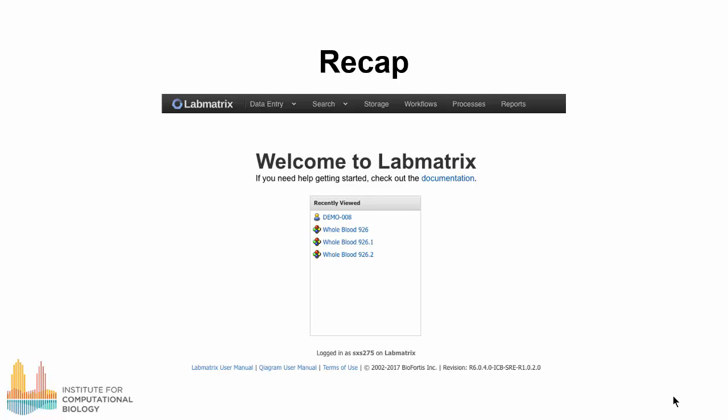In this video, we have seen the basics of Qiagram in LabMatrix, how to build a query, and how to work with reports. For more details, refer to the LabMatrix user manual. A link for this may be found on the opening LabMatrix screen.